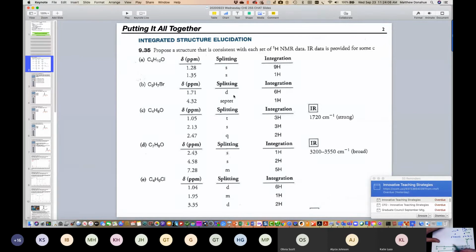But I think it can be confusing. Really, what I want you to think about is that when you put on these electronegative heteroatoms, they move the normal shift towards 10. So the halogens will occur in that region, and that's where we see that methine. So that's how you can rationalize from 0 to 10 how you get resolution of different types of hydrogen.